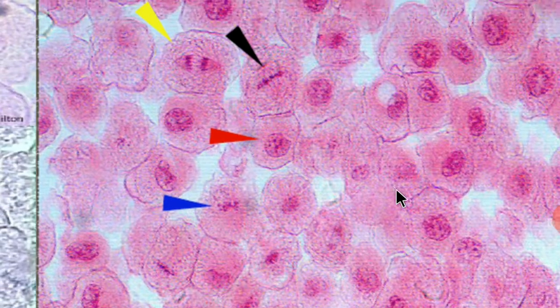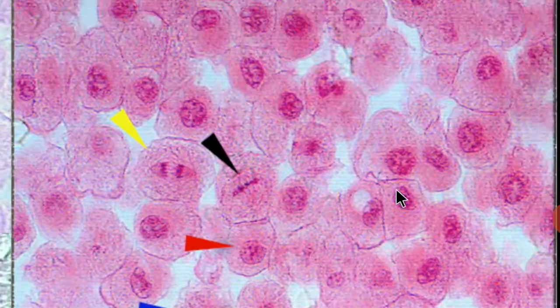Like this, here also you can see prophase and prophase. Now you can see so many cells dividing in their mitotic stages, that is the M phase of the cell cycle.